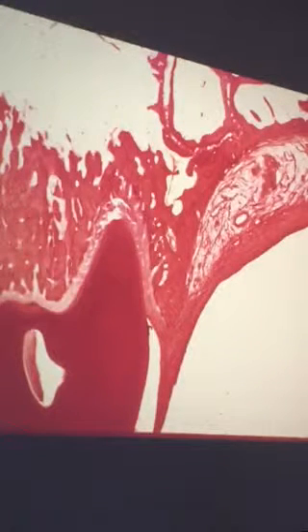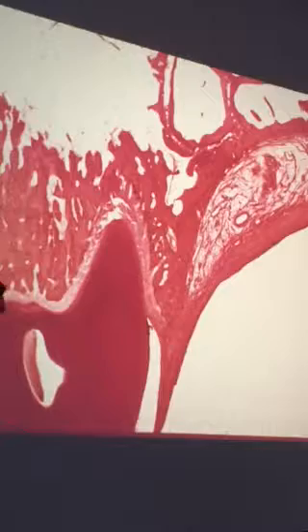Okay, and this is the hard palate, and right in here, what do we see structurally? It's not really a very good picture. That's one of the minor salivary glands found in the hard palate. And we have the epithelium right there, and in this case, right along the median raphe, we would have what sort of situation? Mucoperiosteum.